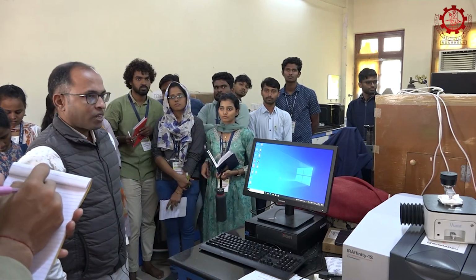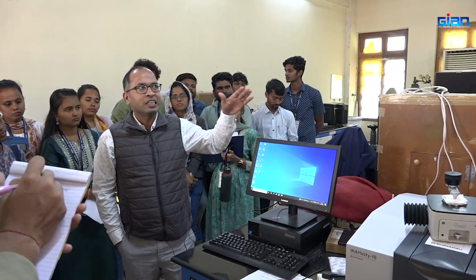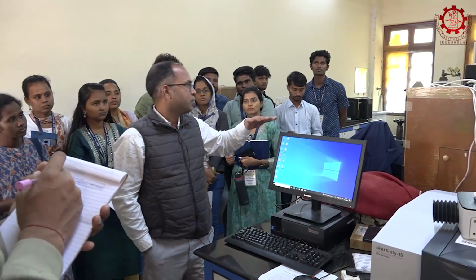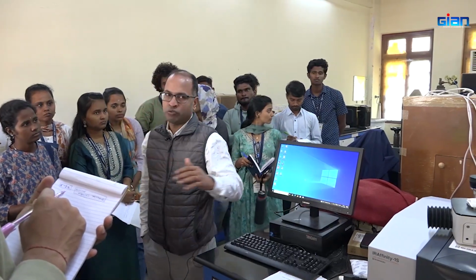So now about this FTIR, first of all, of course, you see this lab is our special instrumentation lab 2. Here you can see many other very expensive and very useful equipment we have housed.